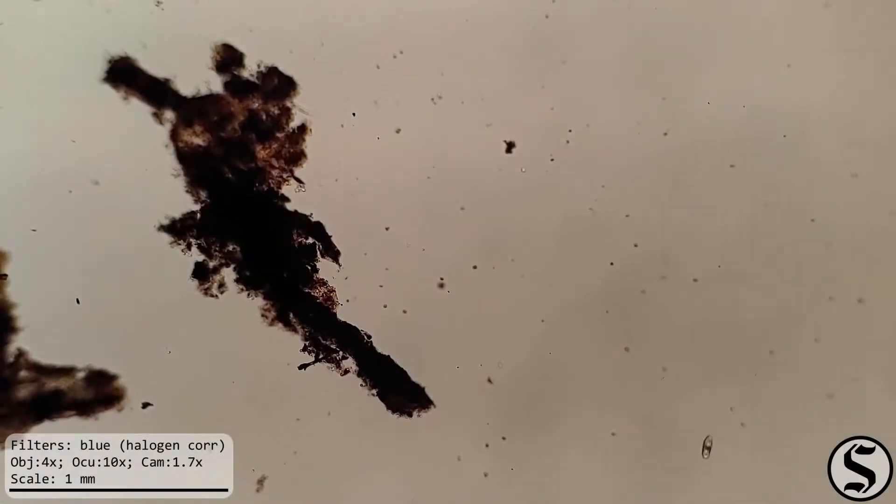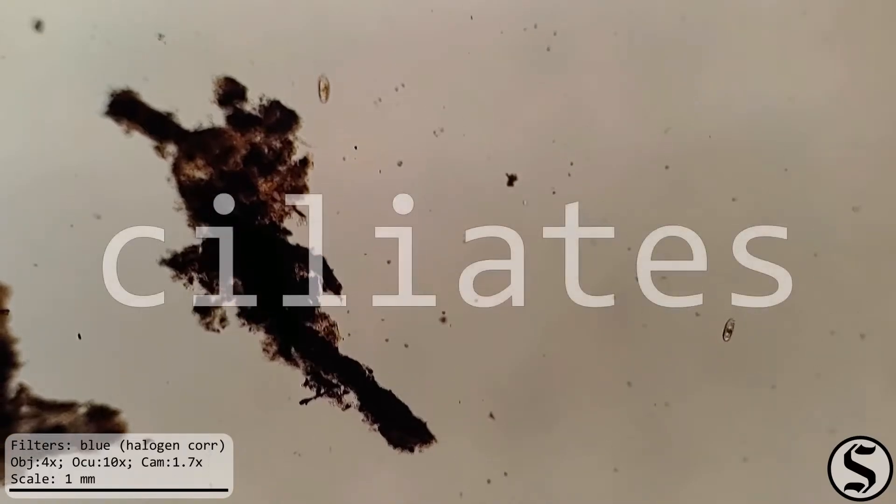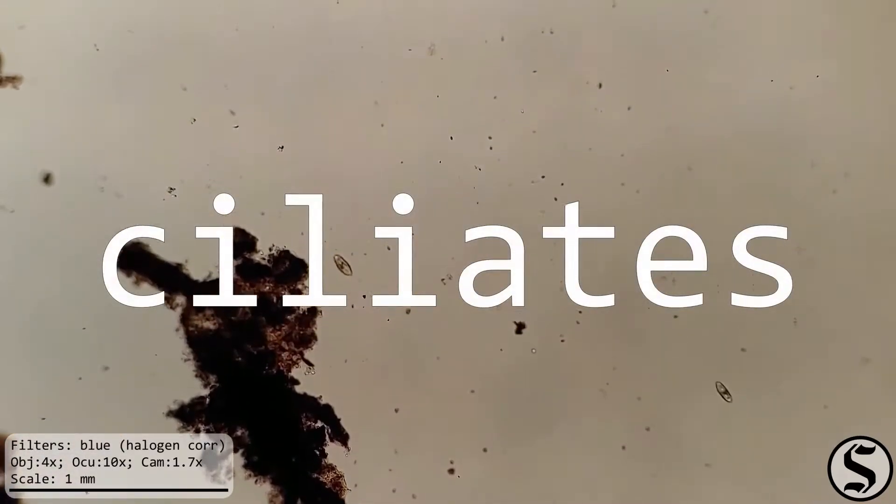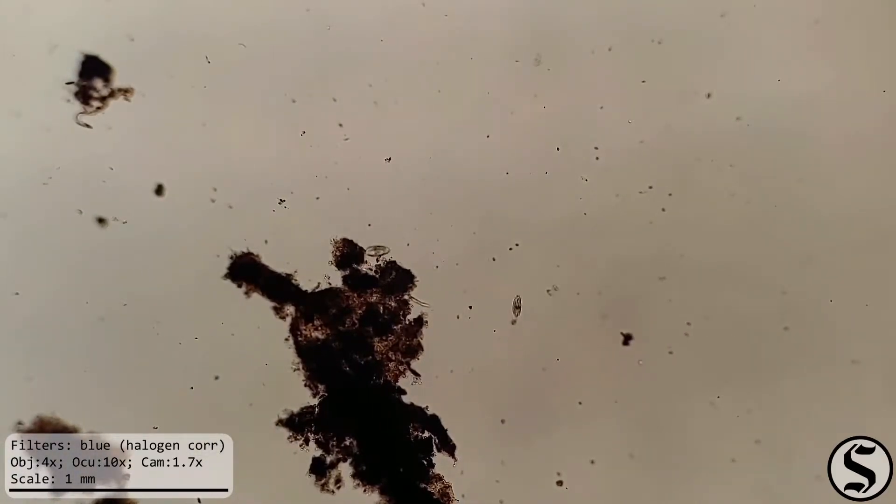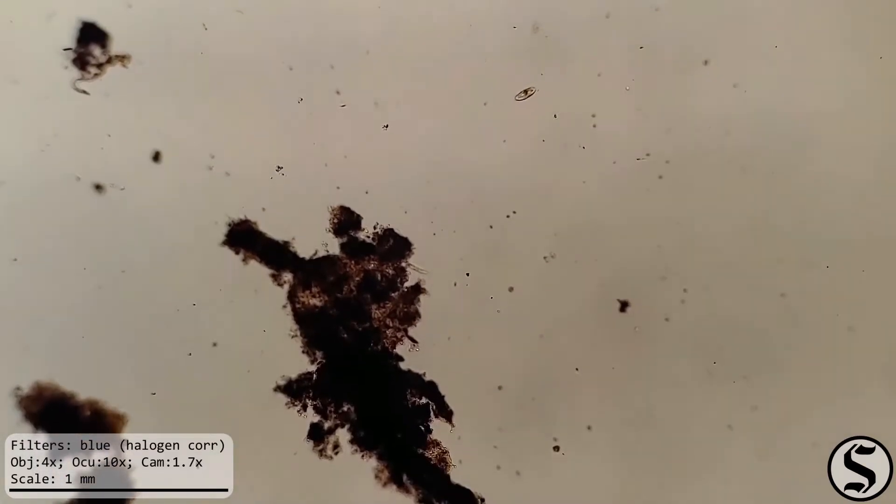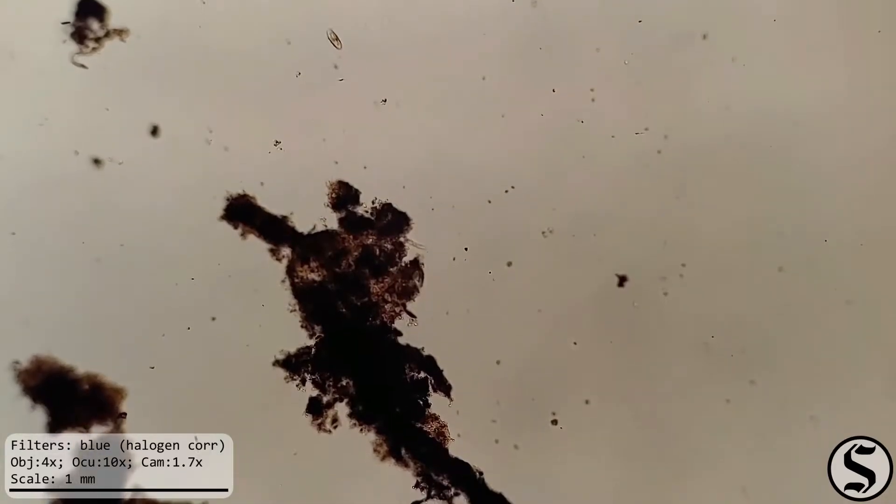Under the microscope we notice that we've got ciliates swimming around in here. Cilia, remember, is Latin for eyelash, and they tend to hang out around these clumps of sediment. They know there's good eatings to be had around there.